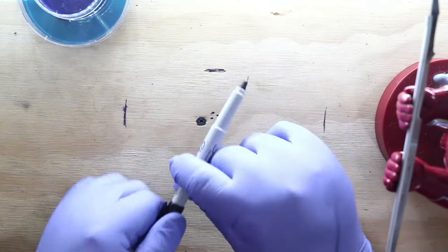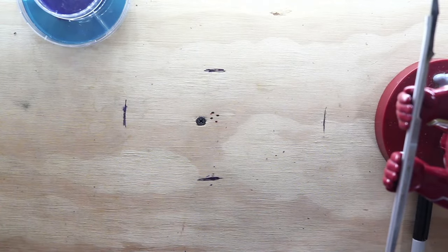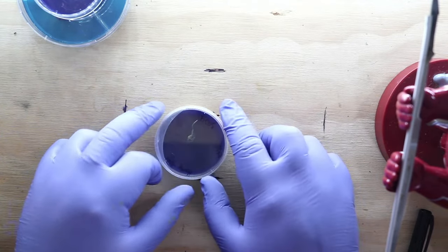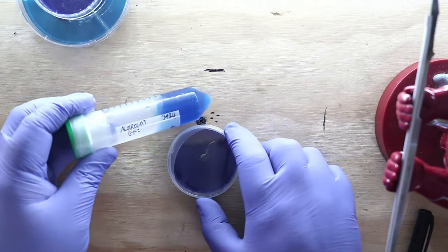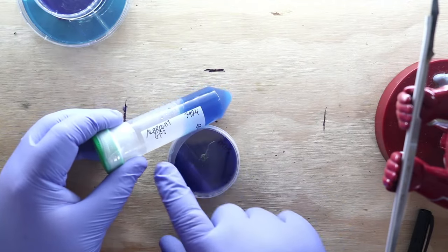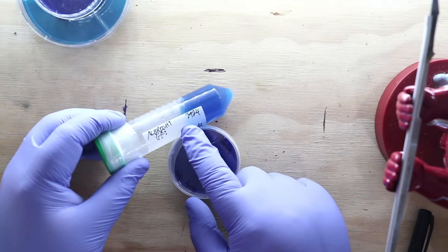And we have lab notes where you'll put the date when you did the transfers. You'll make notes of everything, and then if he transfers that slant over, he'll have the date that the slant was made on the new labeling. That's a good point. So, let's say this dish says 3424 because that's when it was transferred. If I had made this slant from this dish, just underneath the name here I would put this dish number right here. When we do liquid culture, we would put the liquid culture batch number wherever.